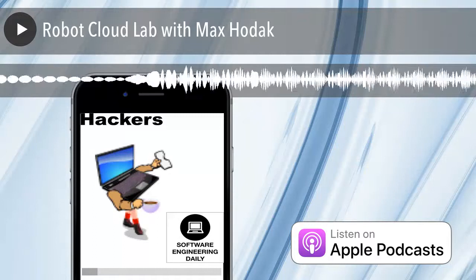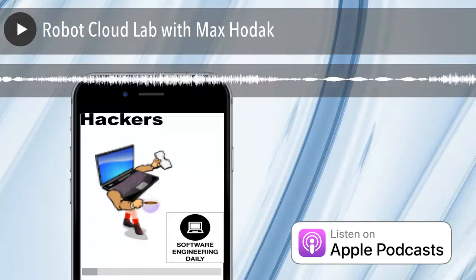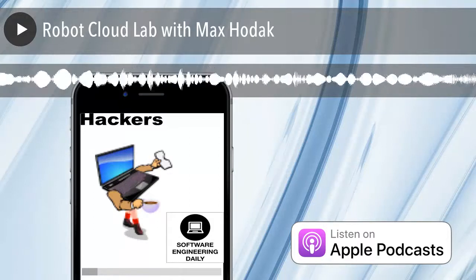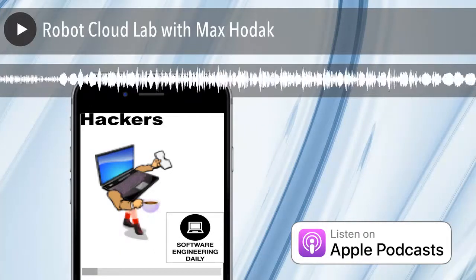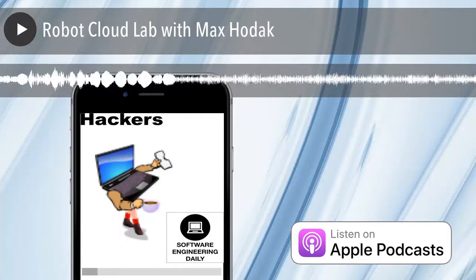Transcriptic is a robotic biology laboratory that allows you to make requests for experiments to run remotely. Scientists who use Transcriptic do not have to perform wet lab experimentation. The robotic laboratory process has the potential to do for biology what Amazon Web Services did for computing. So I was really excited to do this episode.